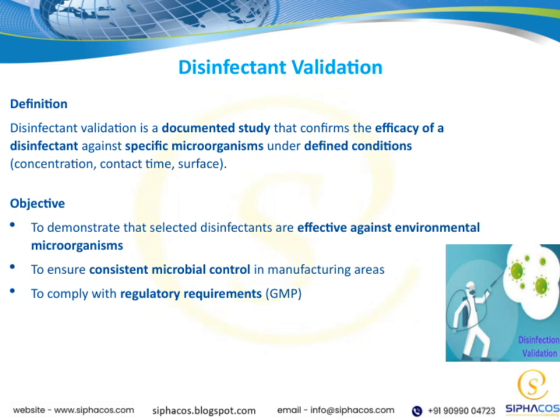Essentially, it's a documented study that confirms whether a disinfectant is effective against specific microorganisms. This isn't just a general test. It's conducted under defined conditions like the right concentration, the necessary contact time, and on particular surfaces.